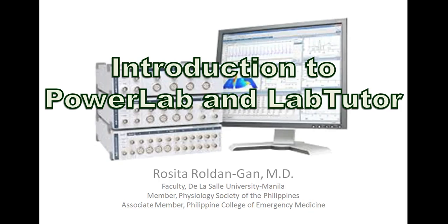So that's the end of our session on the introduction to Power Lab and LabTutor. I hope you will still have a chance to do hands-on one of these days, so that you will have an actual feel of how to use Power Lab and LabTutor. So I would expect your assignment before the deadline. So thank you so much.